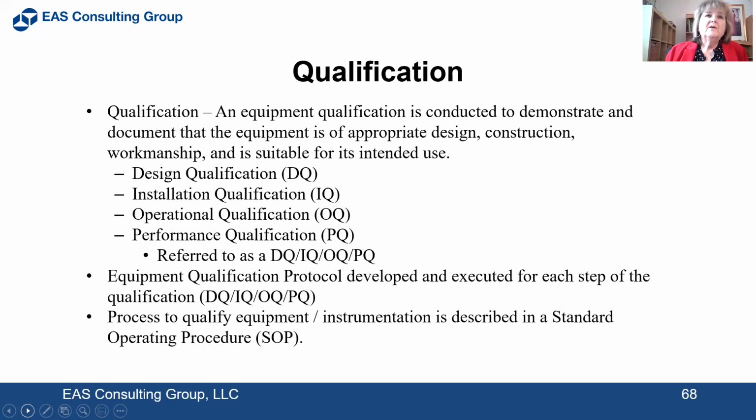So you have to have a protocol to do this qualification. You're going to develop it, execute it, and get it approved for each step. You're going to have a process to qualify your equipment or your instrumentation. Make sure that is described in a SOP.